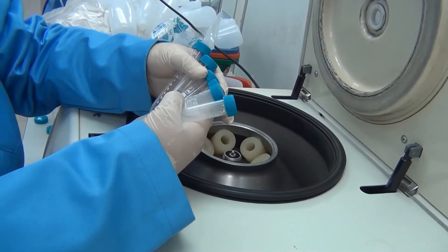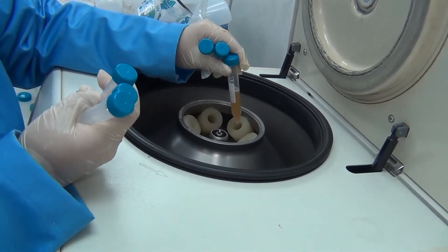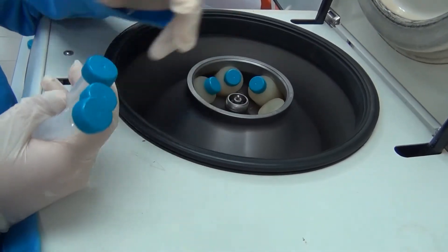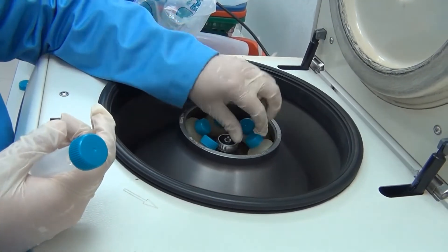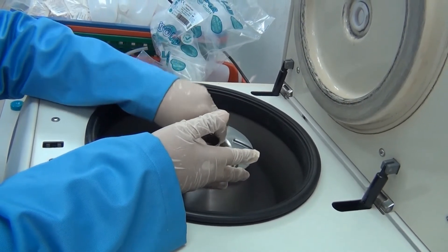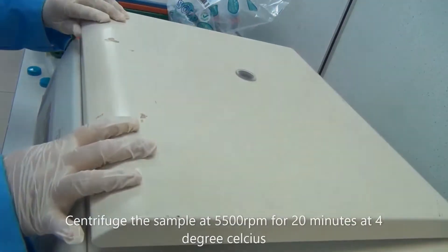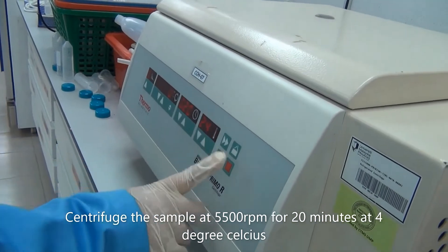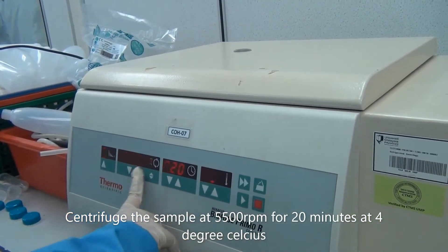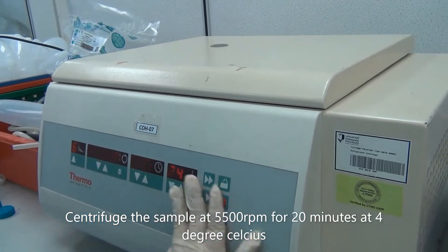Here we transfer all the solutions into 15ml centrifuge tubes because that is the size for this instrument. We put all the centrifuge tubes in. The settings are: 5,500 RPM, 20 minutes, and 4 degrees Celsius. This is the actual temperature. And then we collect it.